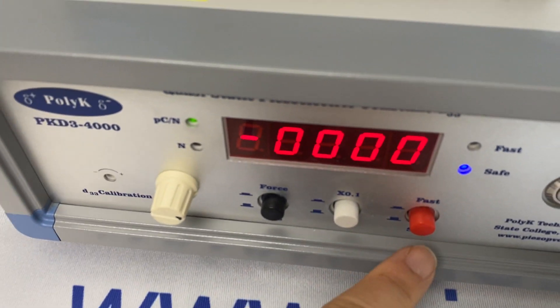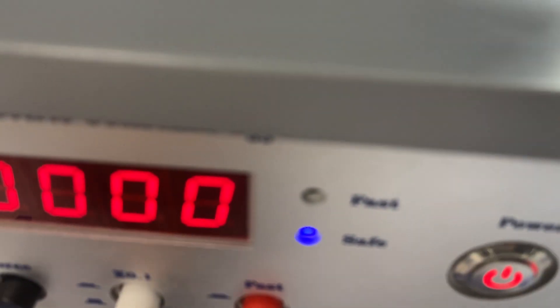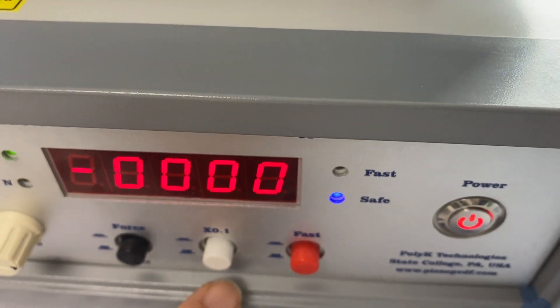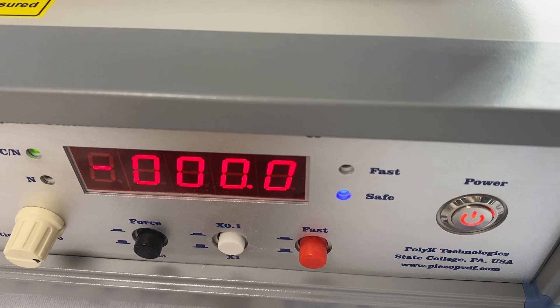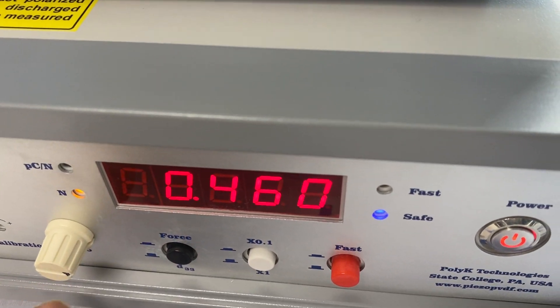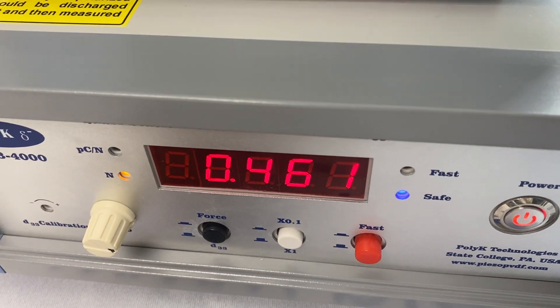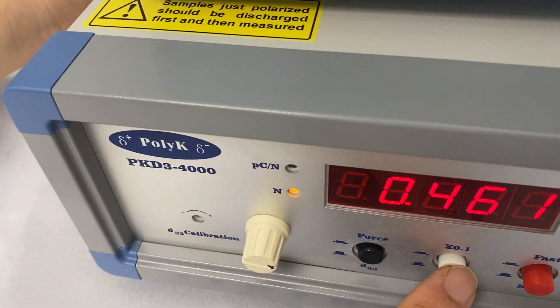Now let's go to the D33 meter. The D33 meter has safe or fast mode. You can also select the 0.1 range, which goes up to 400 picocoulombs per newton, or the ×1 range, which goes up to 4,000 picocoulombs per newton. This button toggles between showing the force or the D33 value. And this one is the zero knob, and this one is for calibration.